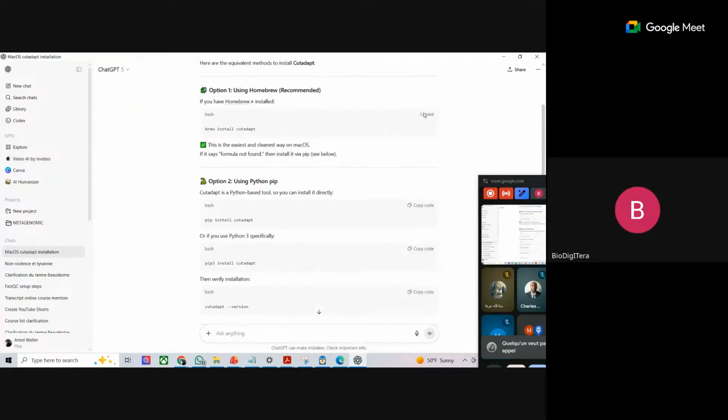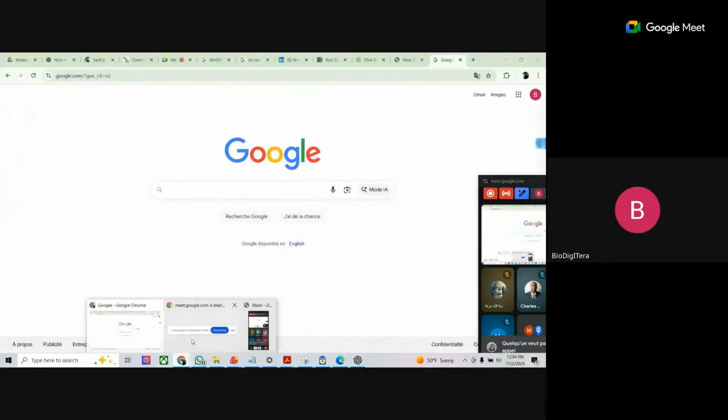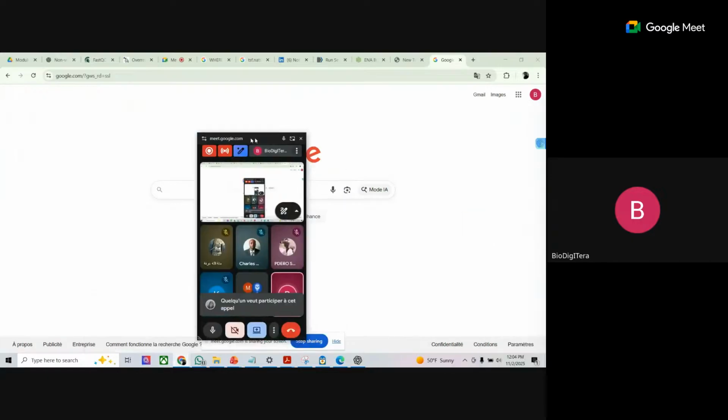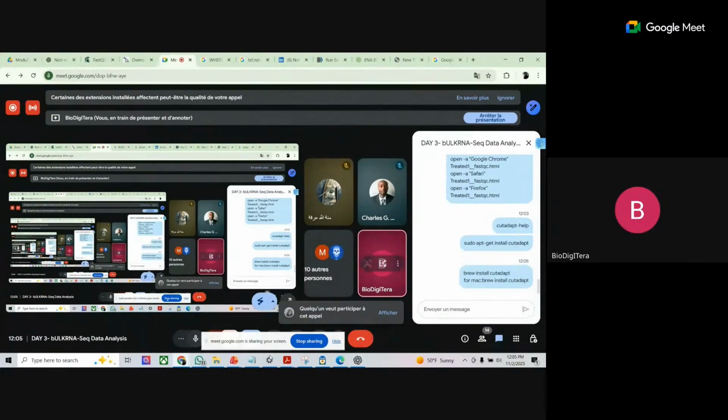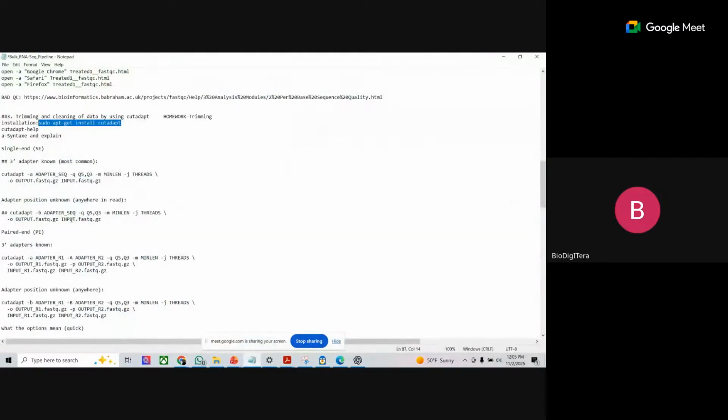Okay. This is for Mac. You know, it's very easy. If you have Mac, for Mac, let me update it in my file.